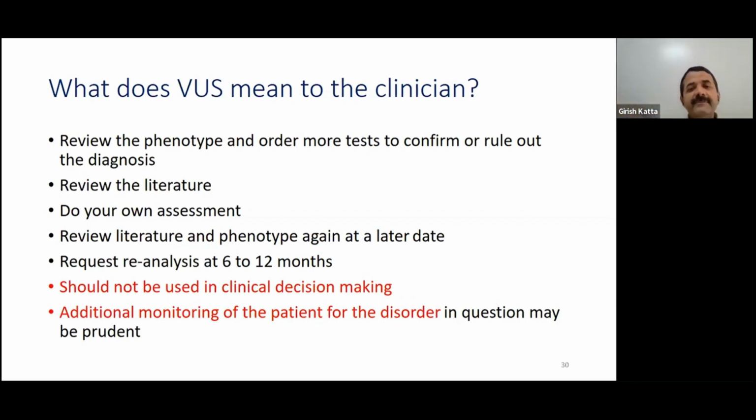Lastly, a few words about whole genome sequencing. Whole genome sequencing is an unbiased way of sequencing the entire genome where you do not have a capture step, so it reduces the bias and errors. It sequences the entire genome, both genes and non-genic areas.